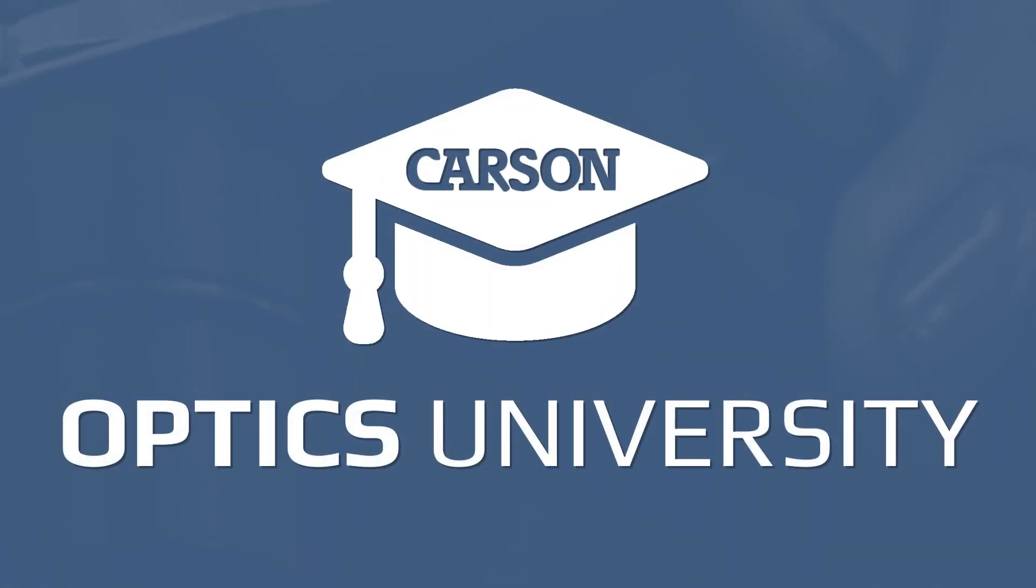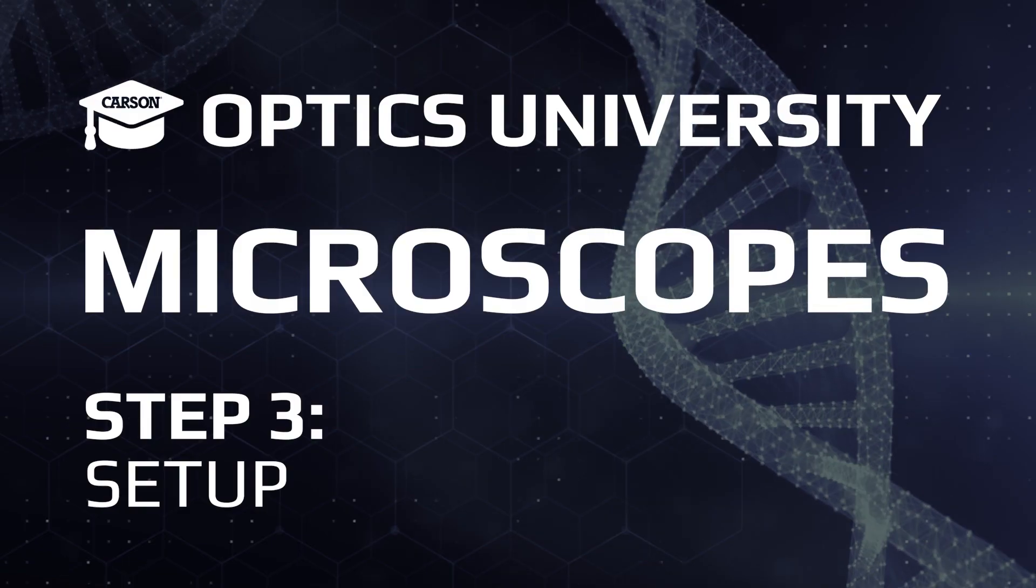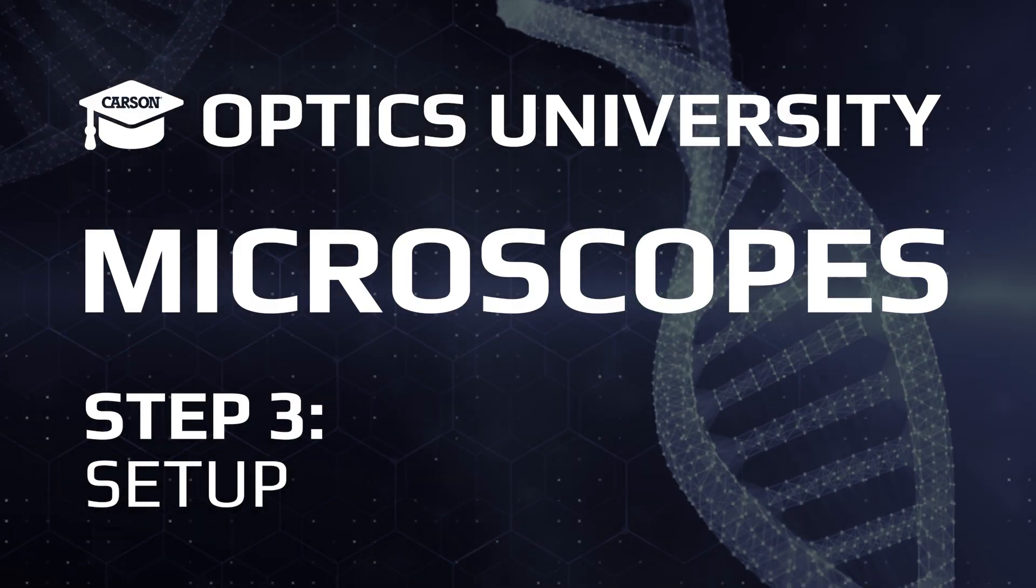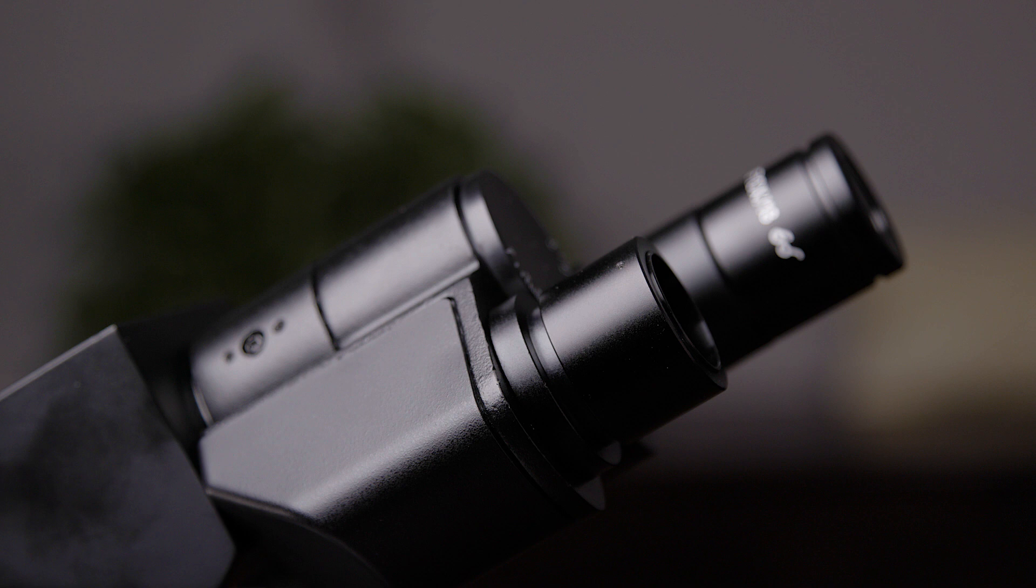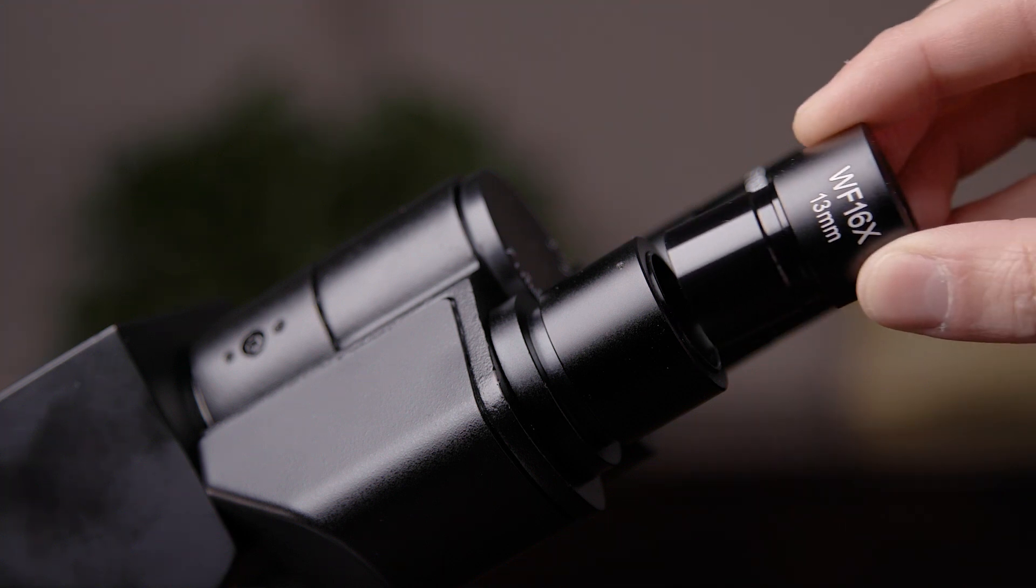Optics University, Step 3: Setup. If your eyepieces aren't already installed, you can simply install them by placing them into the drawer tubes here.